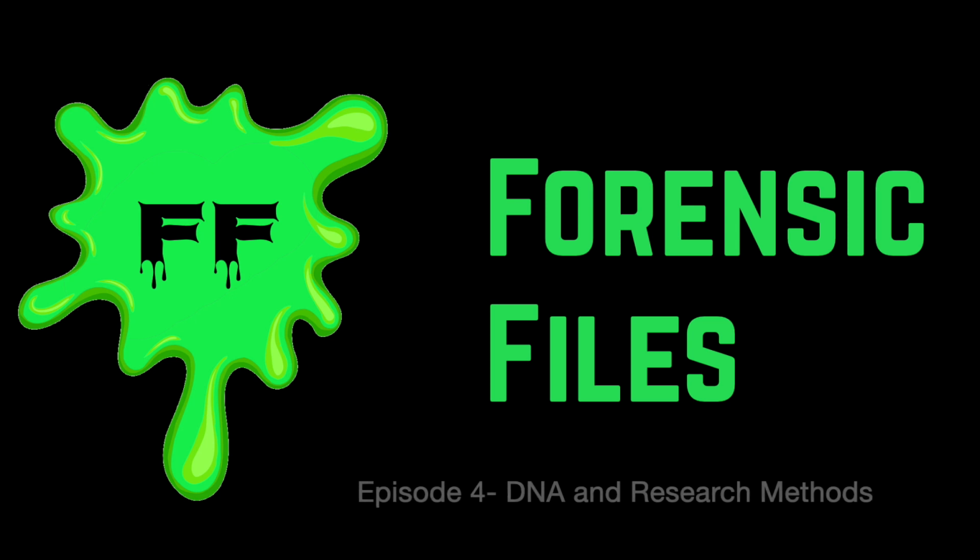The assignment was to try to extract a sample of our DNA and try to observe it without a microscope. It was a more difficult project in terms of understanding and following the directions, but once completed, I think it was all worth it. It began with placing a tablespoon of salt into a cup and gargling that water for 1 minute. This was the most unpleasant part for me, as I don't think anyone really likes the taste of pure salt in their mouth.